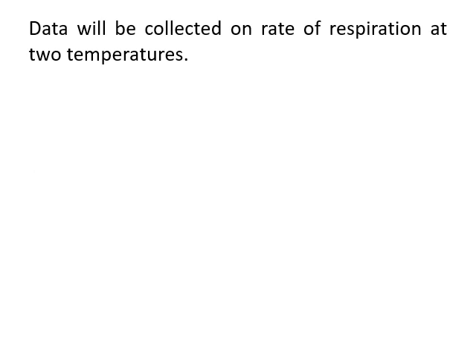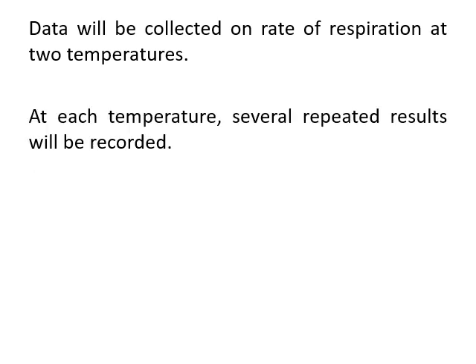So as we've said, we're going to collect some data for 2 different temperatures. We're going to take some repeats. In this demonstration, we're going to take 3 repeats. Remember, the value of taking repeats is that we get more reliable results, we are able to calculate means, and we can identify and discount any anomalies.